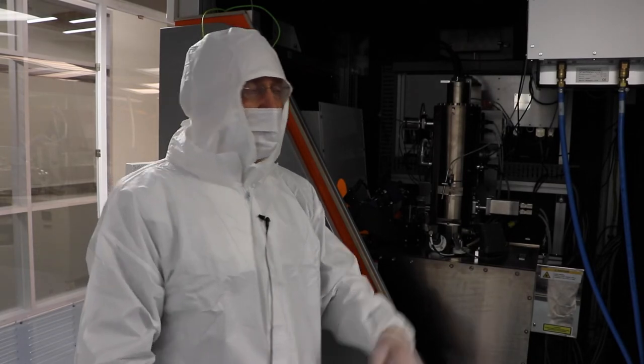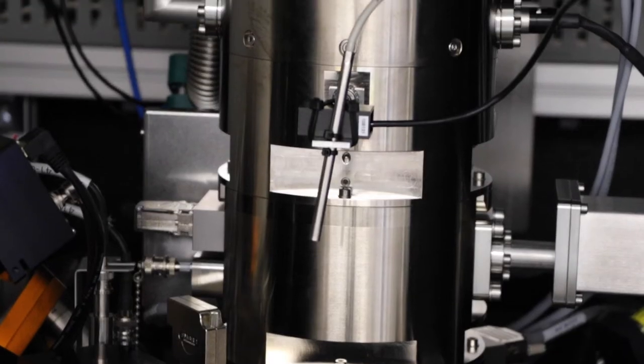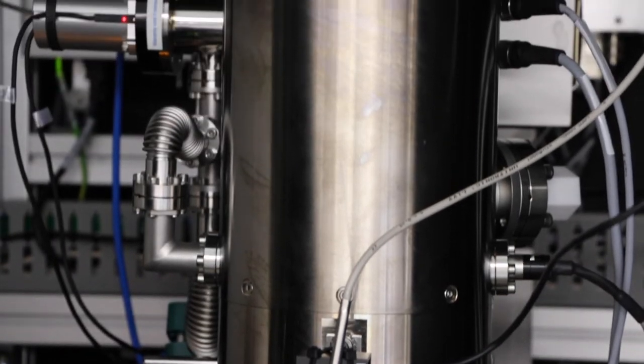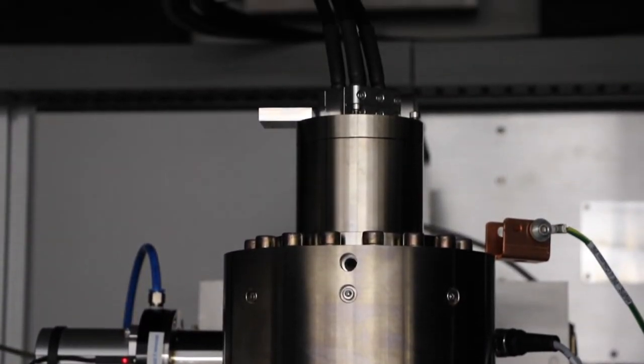On top of the e-beam lithography system is the electron source, which produces the electron beam.